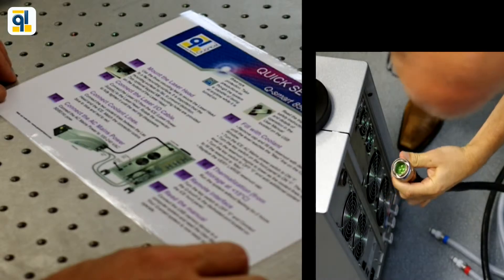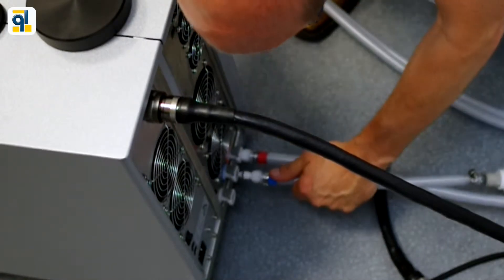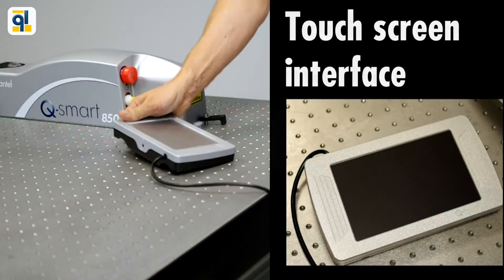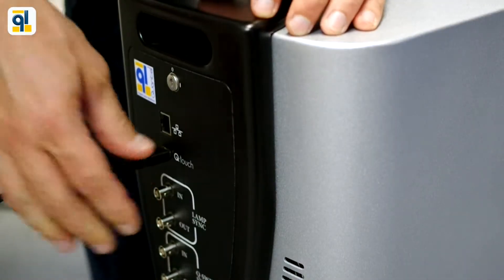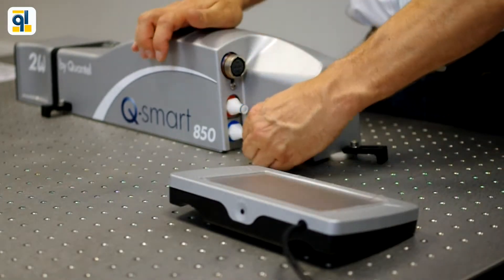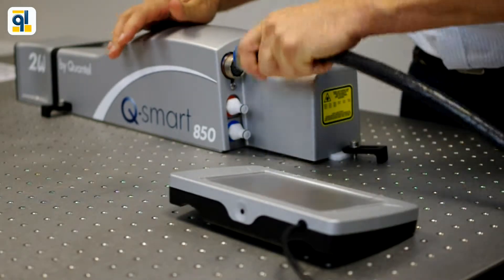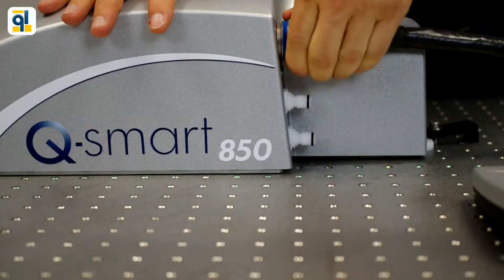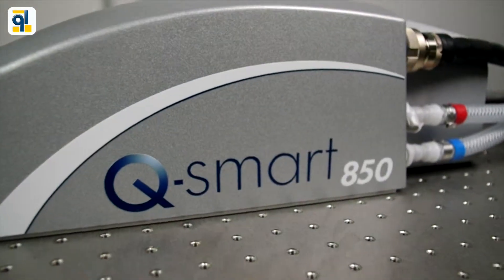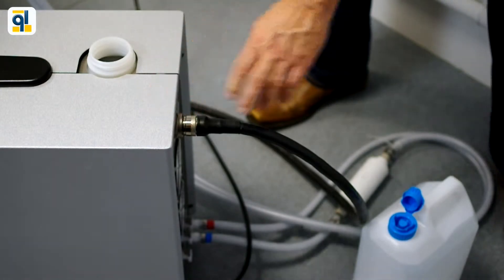Power supply and laser head are equipped with quick connect cables. It is easy to access the water reservoir from the top of the power supply.